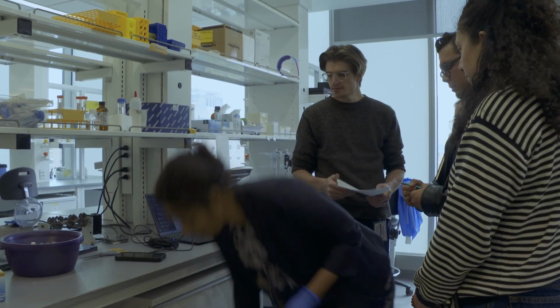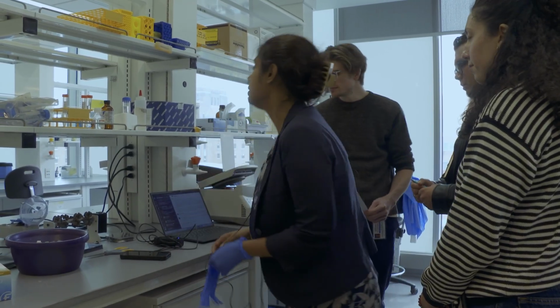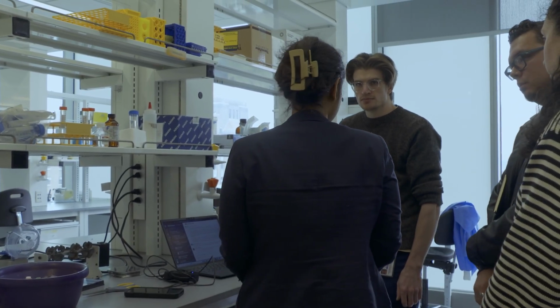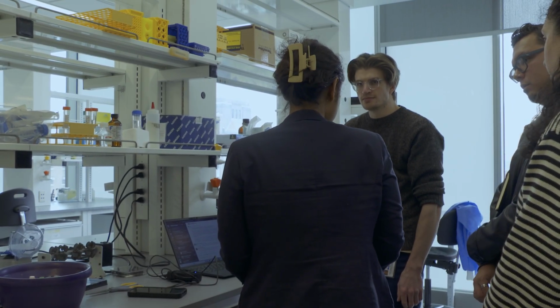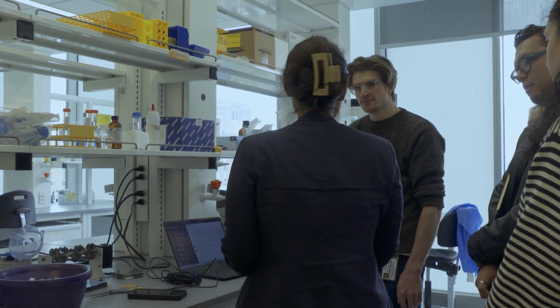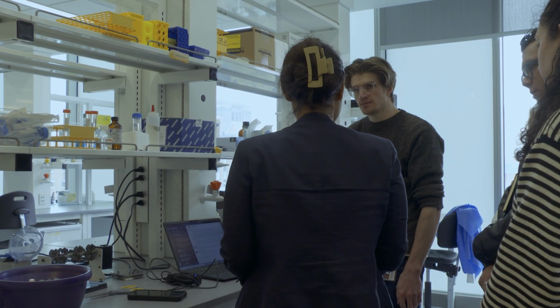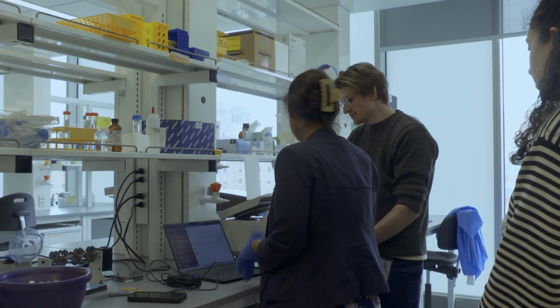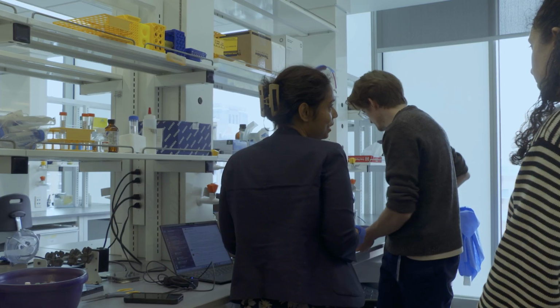Also, I want to mention, I think in our documentation for cfDNA, we do not have any specification about what ratio you would expect for cfDNA. For gDNA, they do have. Nice, yeah. So I do have some internal cfDNA ratio.